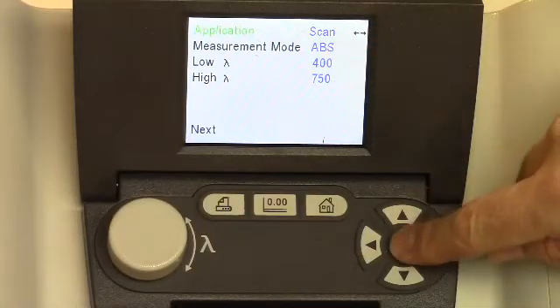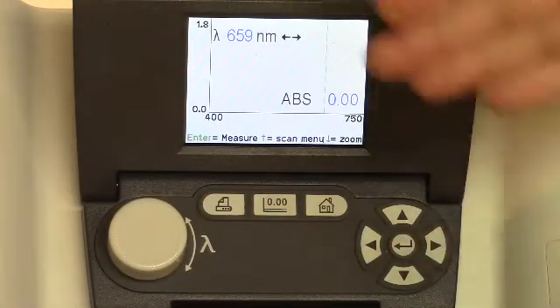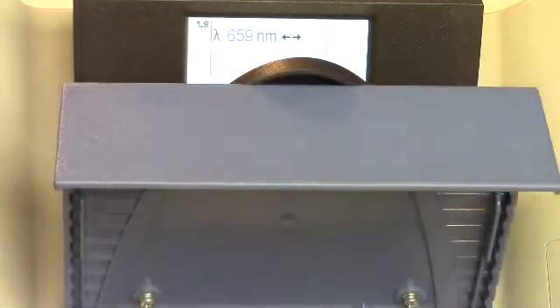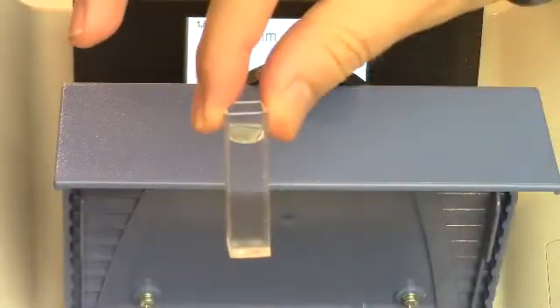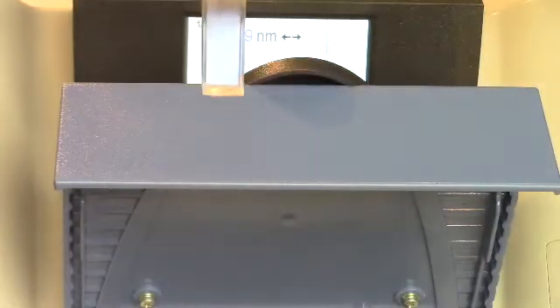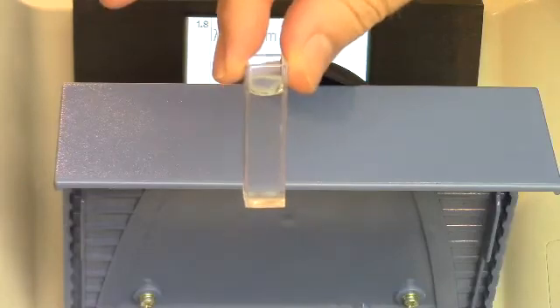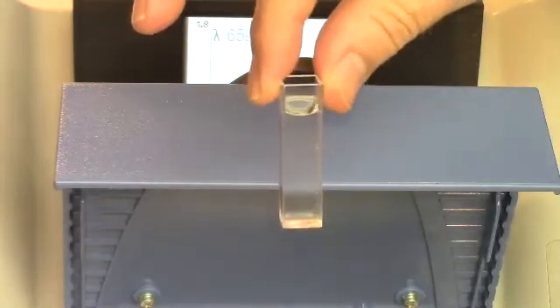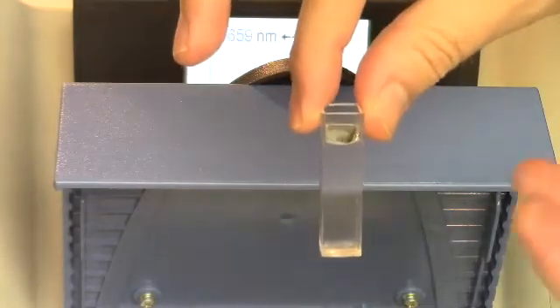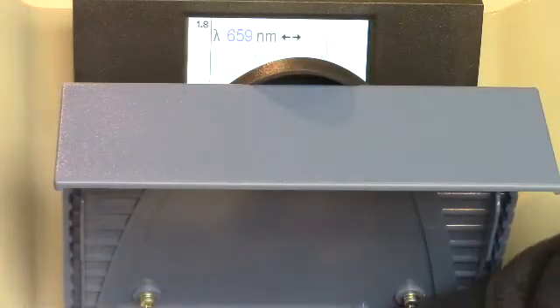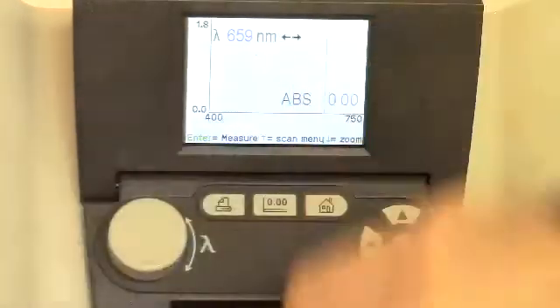So we're ready now to scan. Let's get into the scan menu here. First thing I'm going to do is put in a blank. So this is just one of the cuvettes here, and it just has water in it. Basically what this is going to do is zero the instrument. So any light absorbed by the cuvette or the plastic in the cuvette or the water, that's going to get subtracted out of the spectrum that we end up seeing.